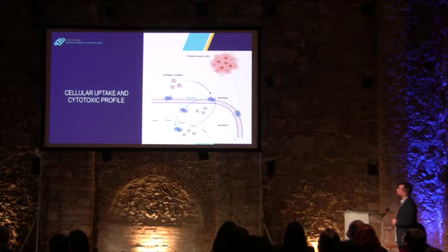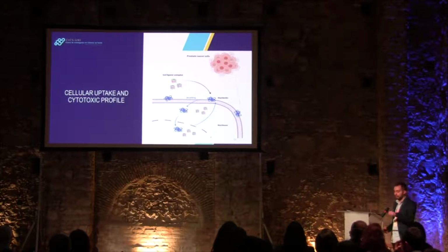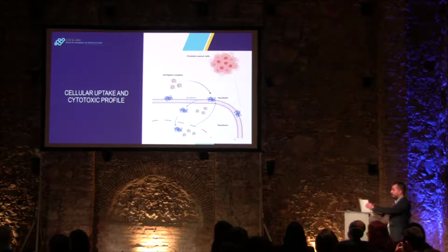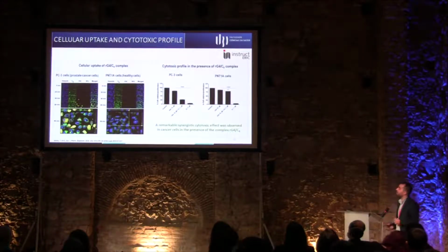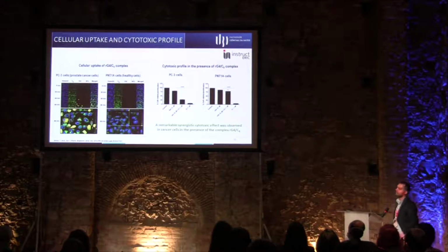By the end, we evaluated the cellular uptake and the cytotoxic profile of the complex G-quadruplex C8 in prostate cancer cells and in healthy cells. To this purpose, we used confocal microscopy. We observed a significant cellular uptake of the complex in prostate cancer cells, but not in the healthy cells.